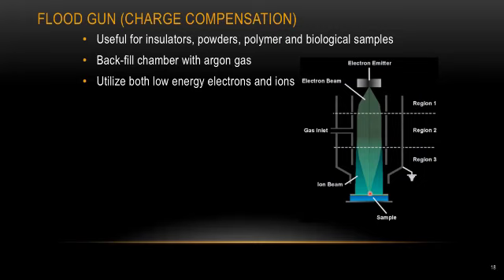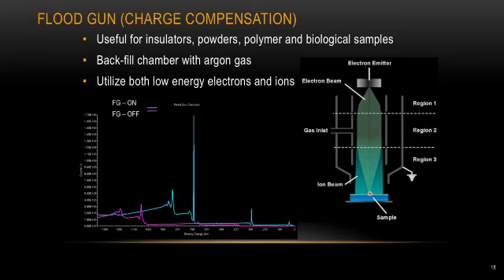And here I'm going to show you data I took in the past. So the data is coming from a piece of Teflon. There are 2 spectra in this data set, and they are coming from the same sample and same spot. The only difference is that for one spectrum, the cyan spectrum, I turned on the argon, and for the magenta spectrum, I turned off the argon. So you can clearly see the difference.